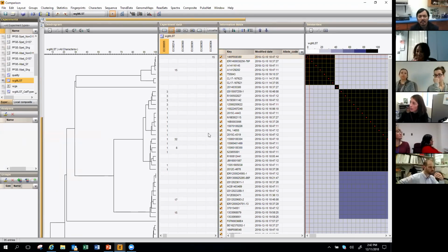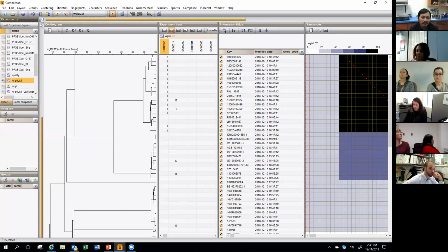Yeah, good question. Okay, so now we have our dendrogram, and you're looking at sequence data here. Unlike PFGE, where you have patterns that you can look at and see, okay, these are indistinguishable and these aren't, it's a little bit more difficult to determine with sequence data at what branch is too much branching. Am I looking for something that's kind of a flat line? Is something like this here a cluster, or is this the cluster, or is it a cluster at all?